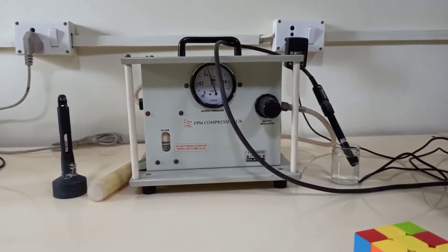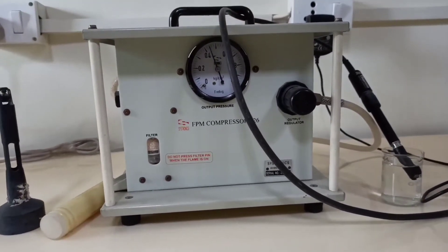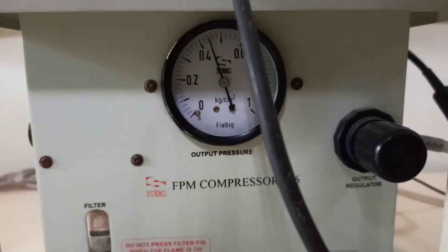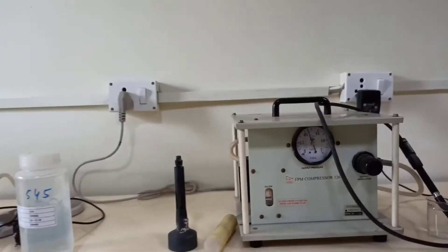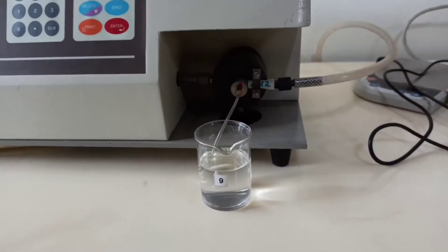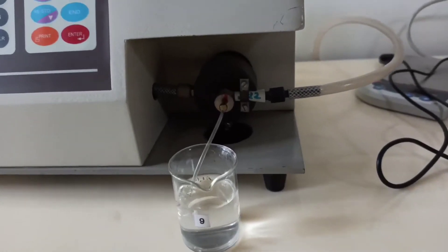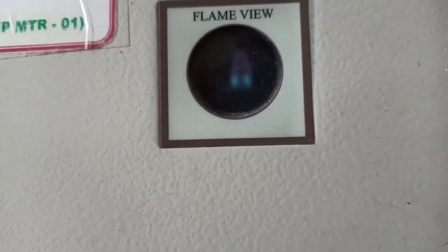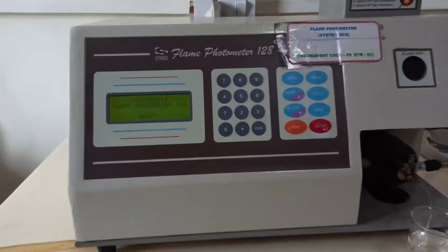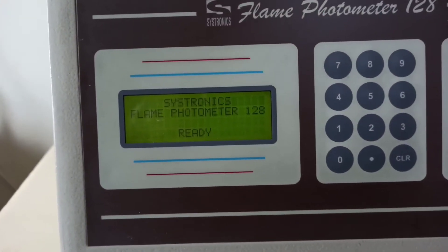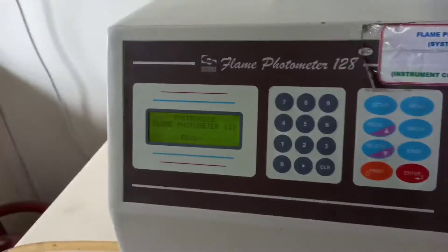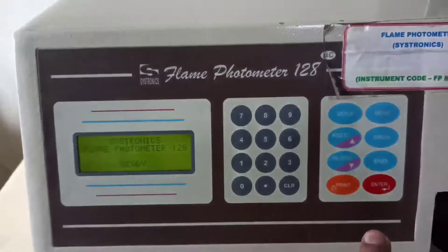Welcome to Analytical Instrument Techniques. Today we are going to analyze the sodium and potassium ions using a flame photometer. In front of me you can see the air compressor, which is attached to the flame photometer. We are maintaining the air compressor pressure between 0.4 to 0.5, which is very important for burning the flame. The flame is burning and we warm up the instrument for almost 30 minutes — warming up is necessary for every analytical instrument. This is the flame photometer by Systronics.